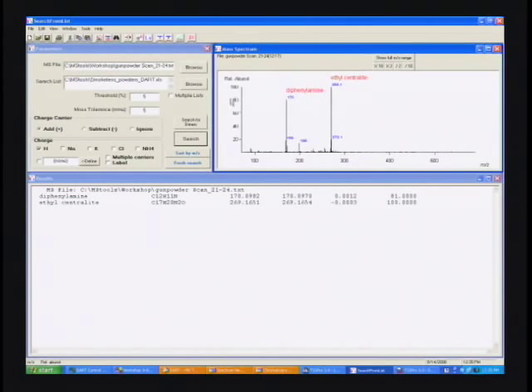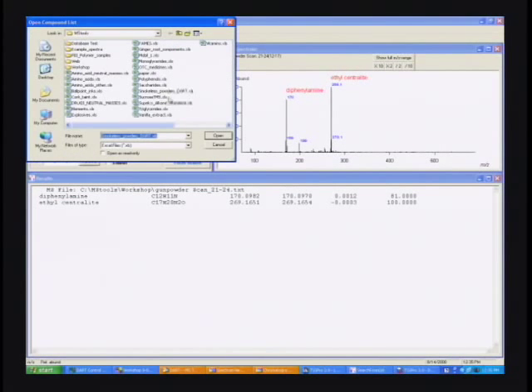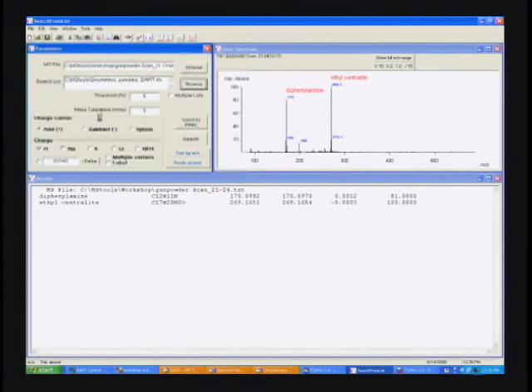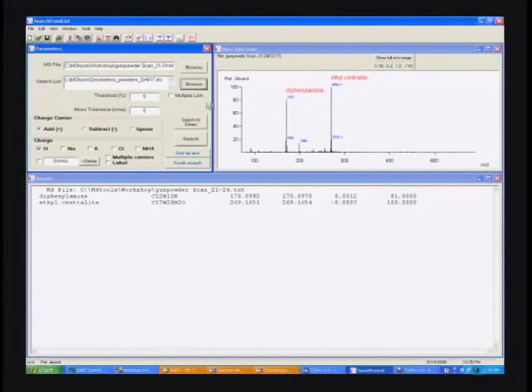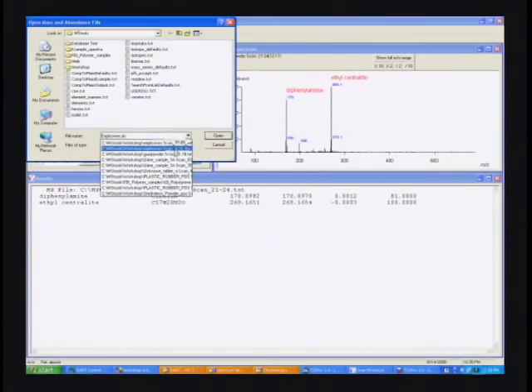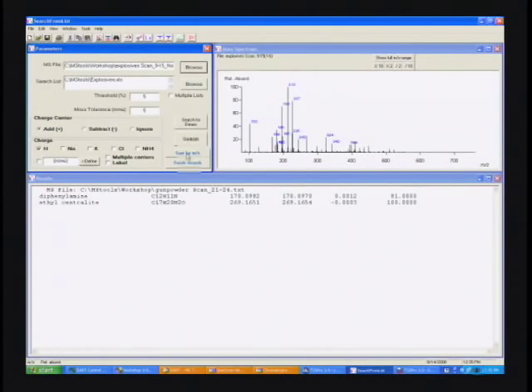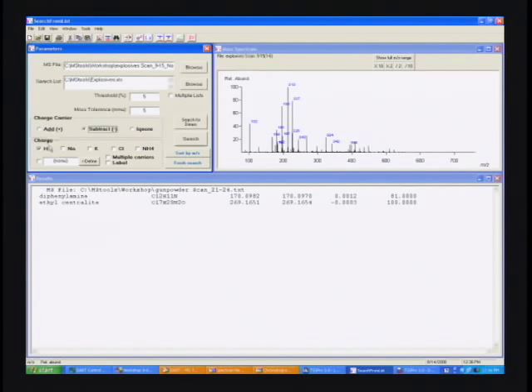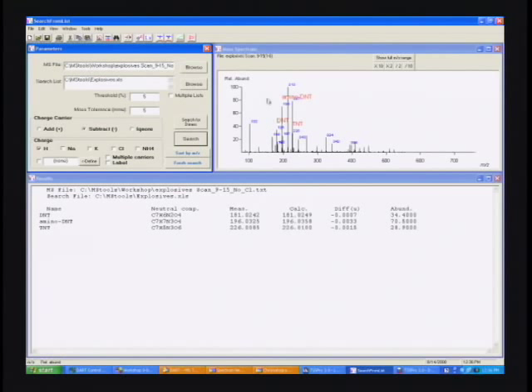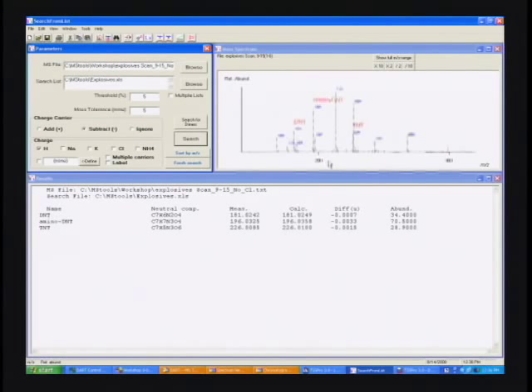Now let's open both of these up. First of all, let's load a list of explosives so that the software will know what it's looking for. This is only going to label peaks if the peaks are identified in the mass spectrum within the specified exact mass tolerance. So we'll take first the no chloride spectrum. And we're looking at negative ions now, so we want to have it look for M minus H's. And here's what it finds.